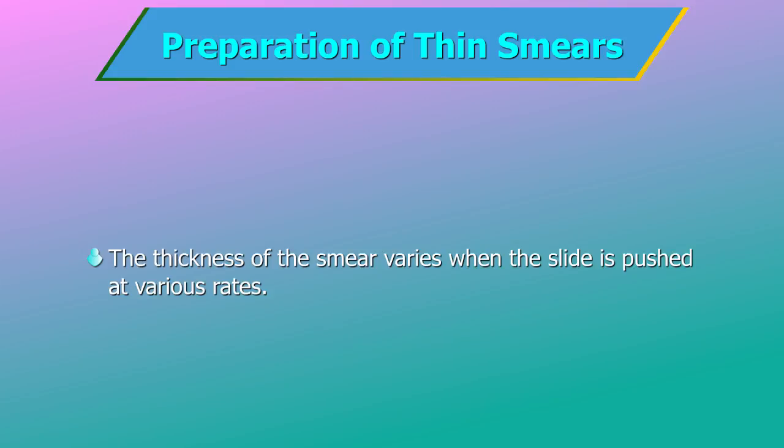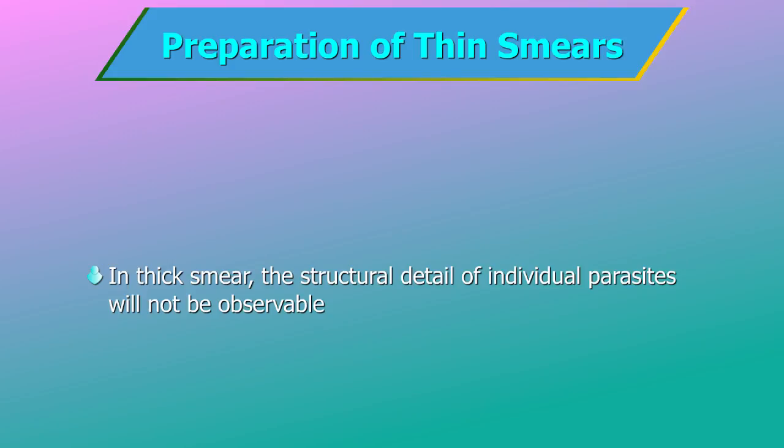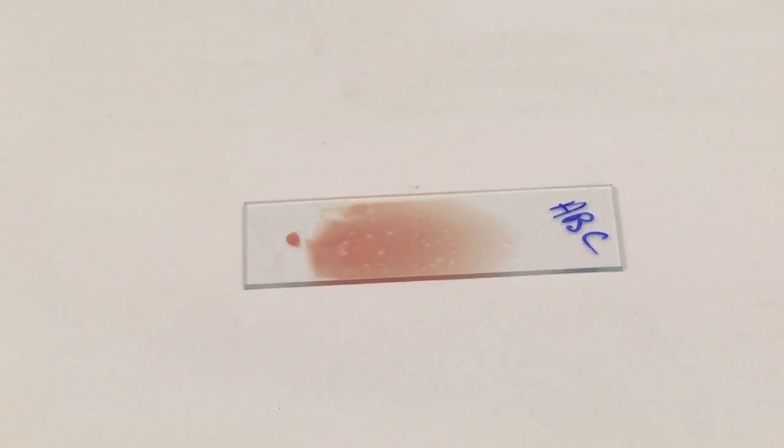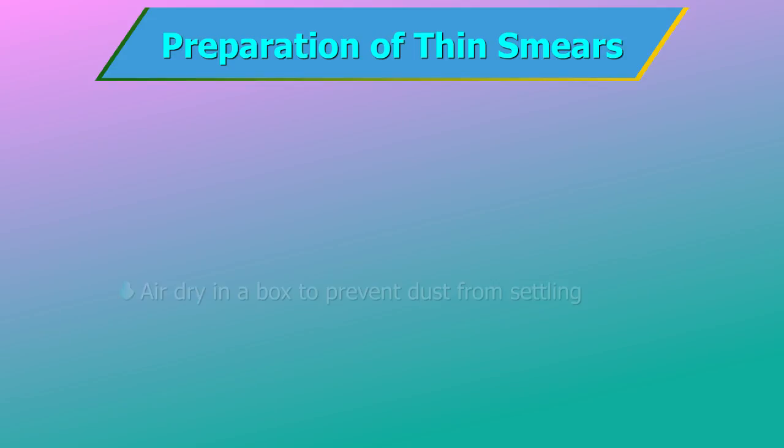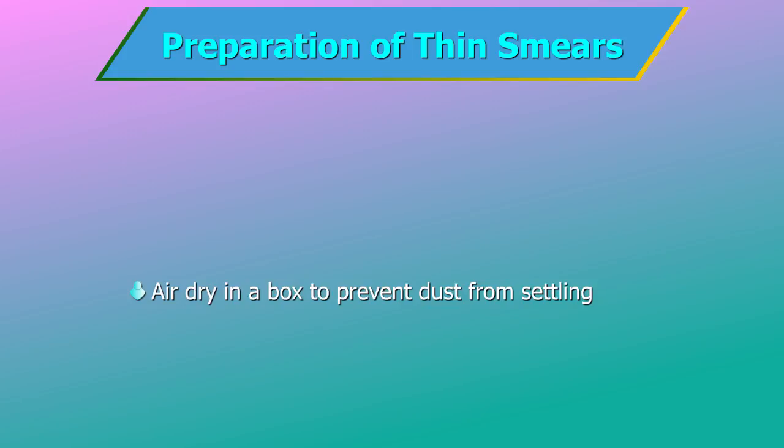Use the correct amount of blood and proper spreading technique to obtain a tongue-shaped smear or a smear with a good feathered edge. The thickness of the smear varies when the slide is pushed at various rates — the slower the motion, the thinner the smear. If the smear is too thick, the structural detail of individual parasites will not be observable. A well-prepared film is thick at one end and thin at the other: a single layer of evenly distributed RBCs with no cell overlap. The thin, feathered end should be at least 2 cm long and the film should occupy the central area of the slide with free margins on both ends. Air dry in a box or other container to prevent dust from settling on the slides. Do not dry with heat.